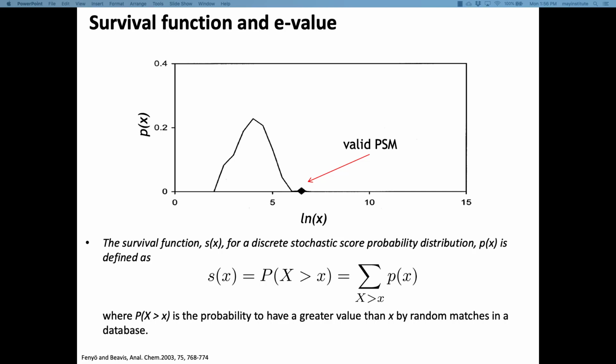And as I said, random matches can occur as well, have to occur, because you have enough peaks that are distributed over this spectrum. And you can just look at the probabilities of that, and you would then just decide, well, if I know the probability of this occurring by chance, then I can make an informed decision how much I trust that. And that is already hinting at this idea that we will discuss this afternoon, what's the so-called false discovery rate, to what degree can you trust your results.